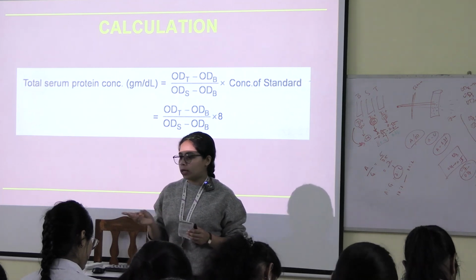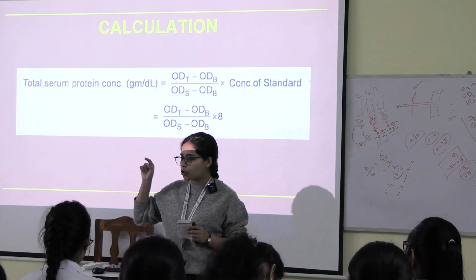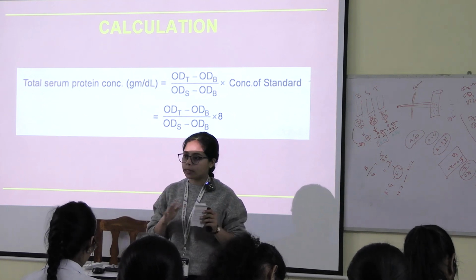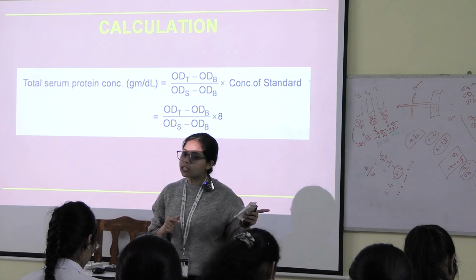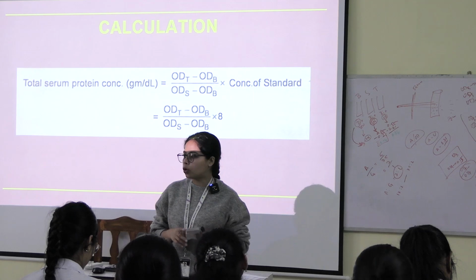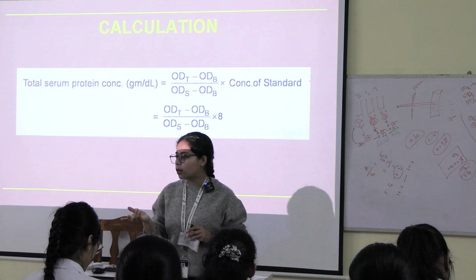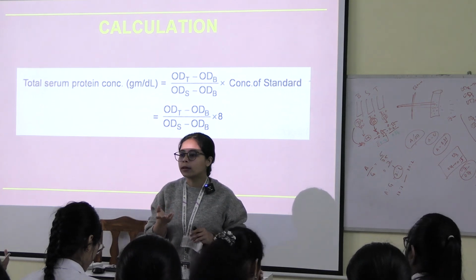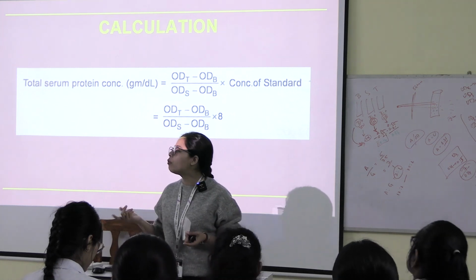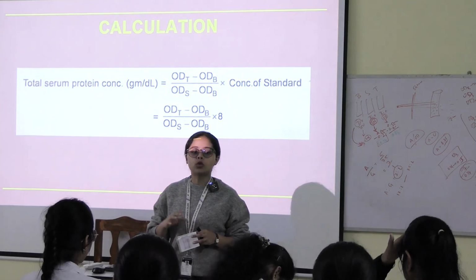And when you do both the methods, when you go there in the lab, some will do this formula by subtracting manually, that is with your hand you will do the calculation and subtract. But if you are doing the other one, the division one, the machine will subtract it for you and you will only do the division, and in that also you will get the same value only. Now suppose somebody got 10 and somebody got 9.8, is it same or different? It is same. The difference is of what? 0.2.